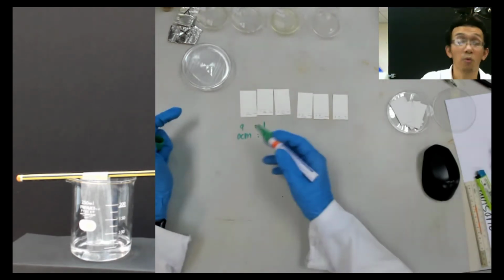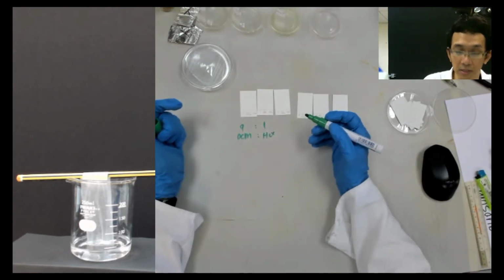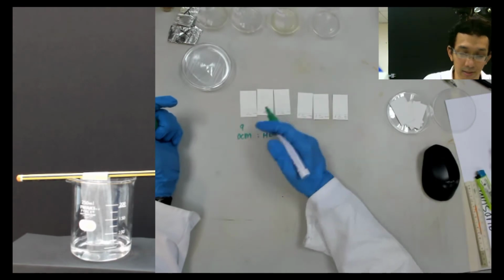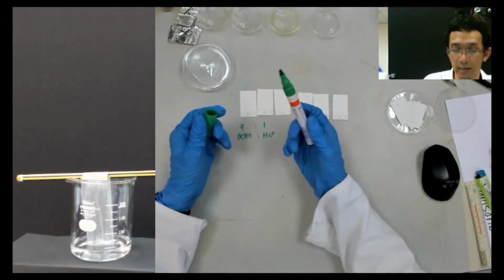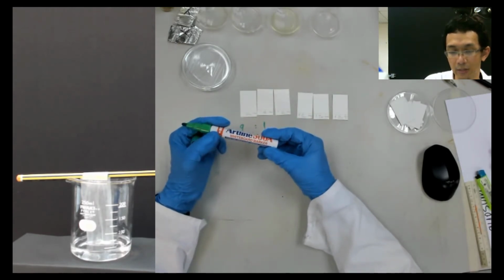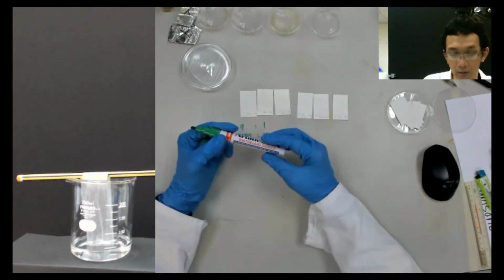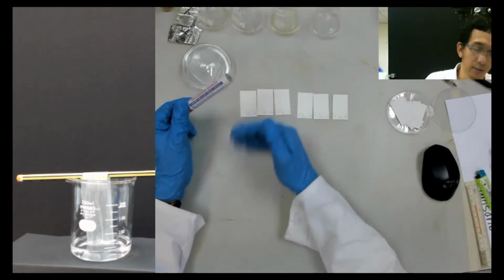Don't worry about scribbling on the table, because you can use acetone or ethanol to remove this. You can normally use acetone, because this whiteboard marker is a little bit polar and a little bit non-polar, so you can dissolve it with that, not water.